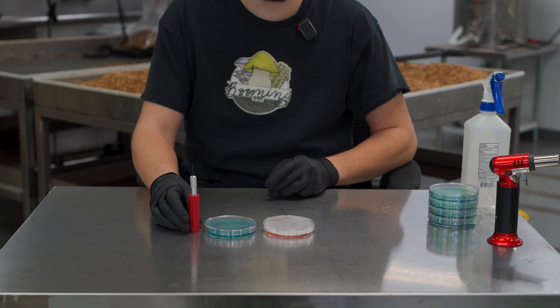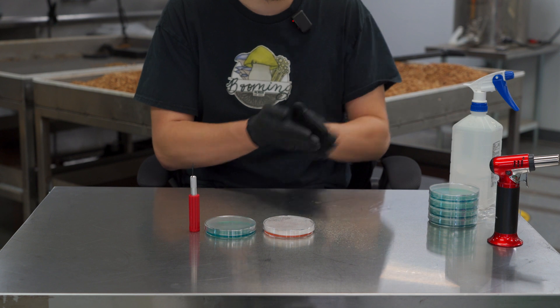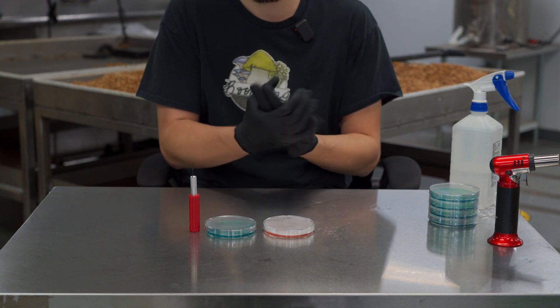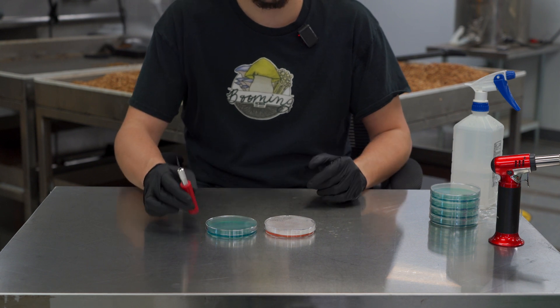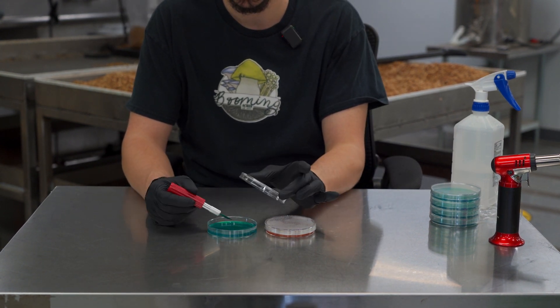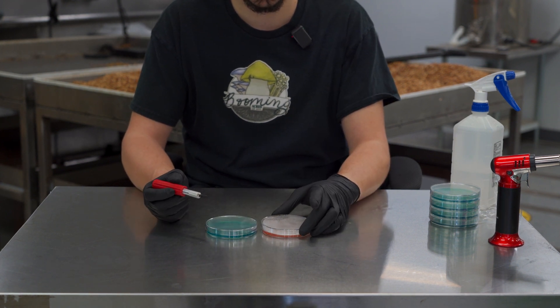While that's cooling down, take some rubbing alcohol — 70 percent — and clean your hands off nice and neat. Once that's dried, take your exacto knife and dab it on the center of your petri dish.